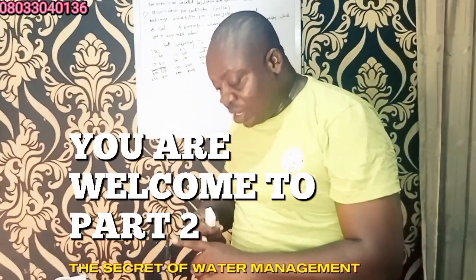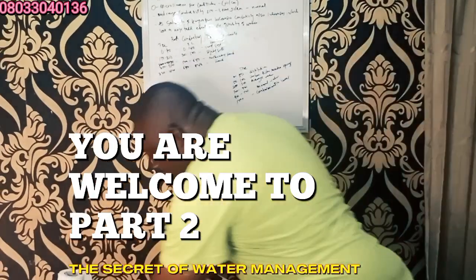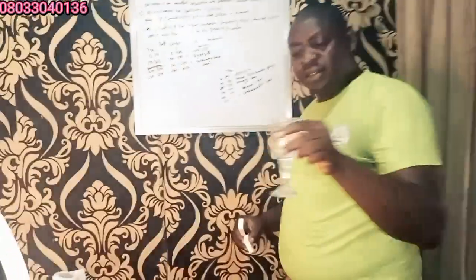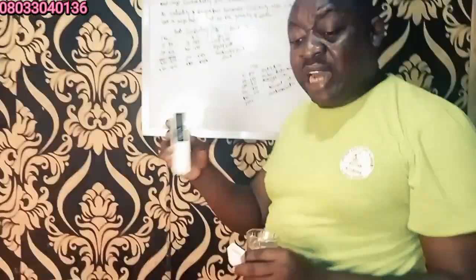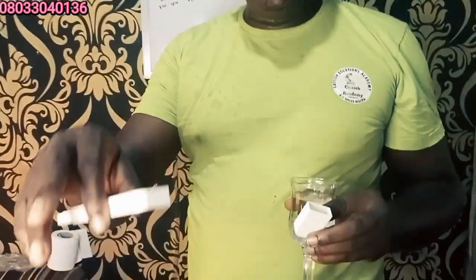Going to do the testing now so that we can have the topic very, very crystal clear to use. Let me just take some water from here. So this water is the borehole water, and I'm going to do the testing for the water conductivity. But the good thing about testing for your water conductivity is you understanding your water temperature.